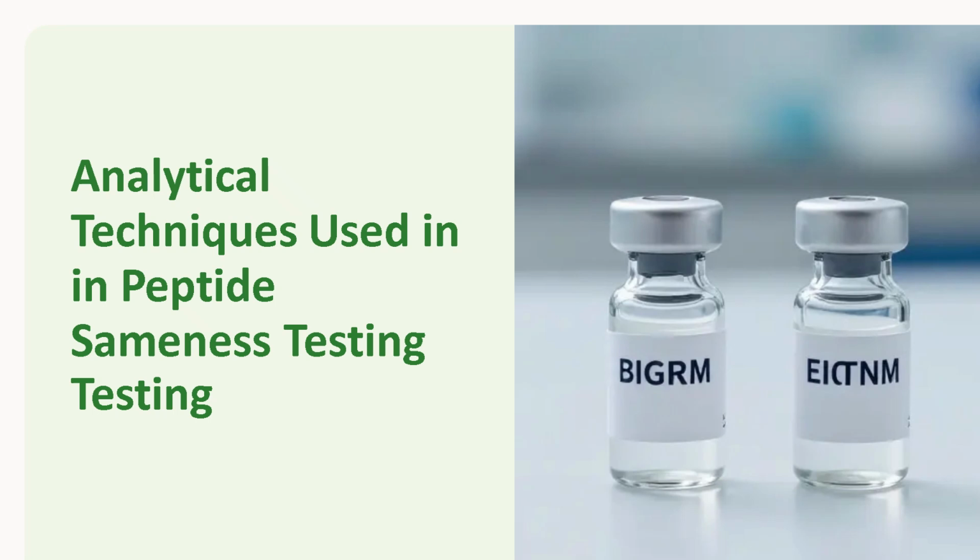Welcome to this presentation on analytical techniques used in peptide sameness testing. Peptide therapeutics are increasingly used in modern medicine, but ensuring that each peptide drug is consistent, pure, and structurally identical to the intended product is extremely important. Even small molecular differences can affect the safety and effectiveness of the drug.